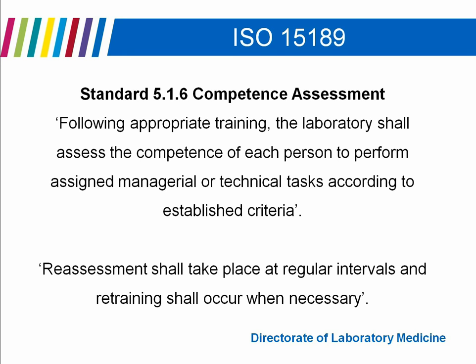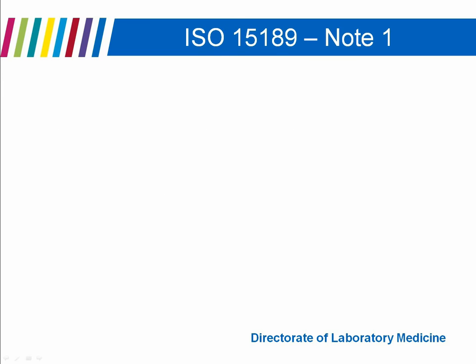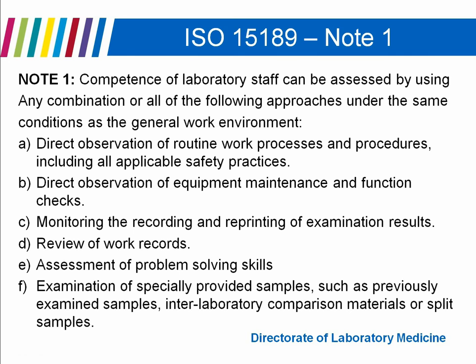Helpfully, ISO 15189 516 includes two notes. And the first note actually provides detail of what is expected in terms of competency assessment. So it actually maps out the approaches that we should take. It tells us we should use direct observation, monitoring and recording of examination results, review of work records, and assessment of problem-solving skills. So this note is actually quite useful, and we should focus on this when we're carrying out our assessment of competence.